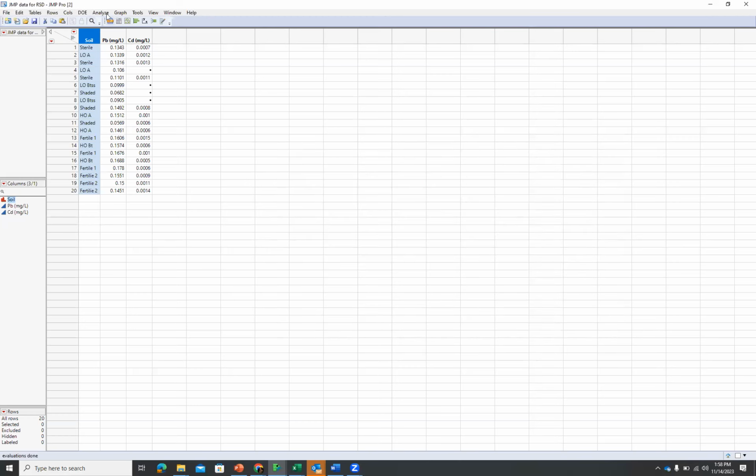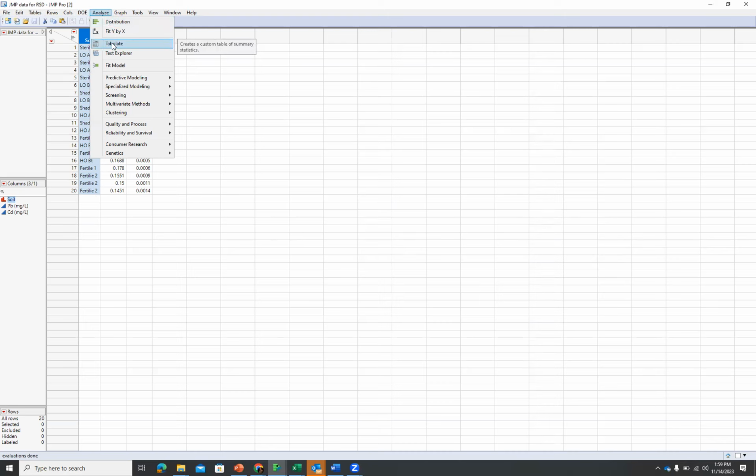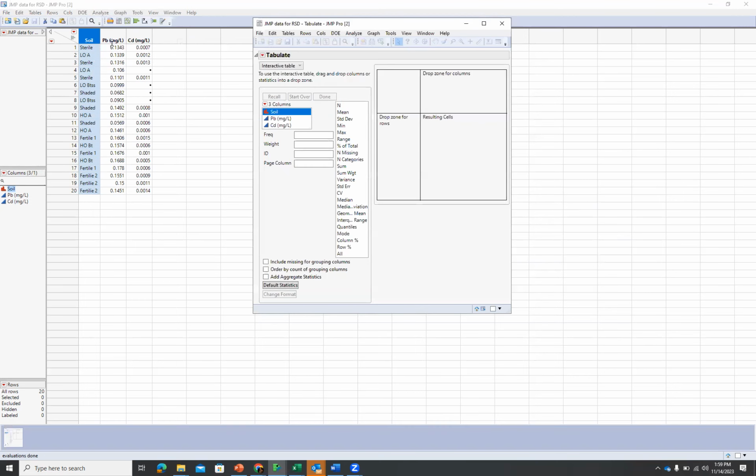All right. So you remember what we do? We just want some descriptive statistics. Before we do that, make sure that your data are nominal for soil and numeric for lead and cadmium. Then analyze. Remember? Tabulate. Is that what you're going to say? No. Anna, you were going to say that. Okay. Analyze, tabulate. Yeah.